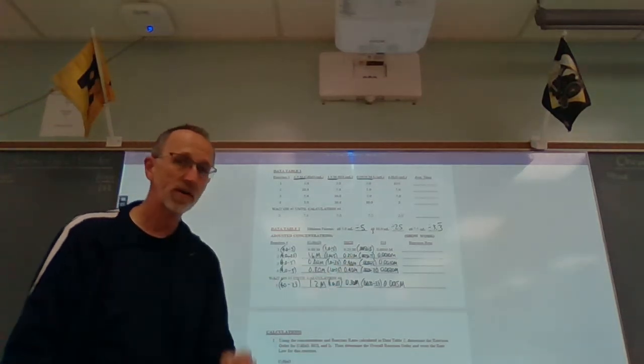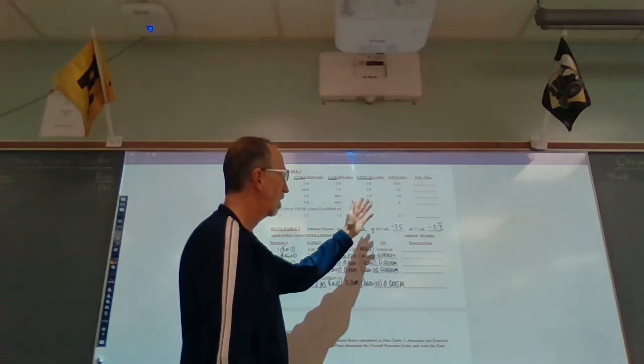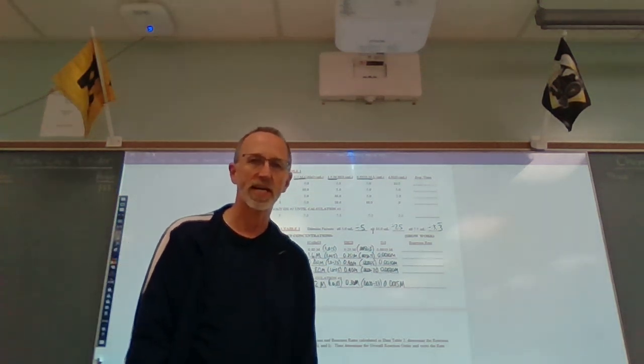We're going to go back here in a second and talk about the procedure itself, and then we will come back and fill in the rest and then take a look at the calculations. Okay?